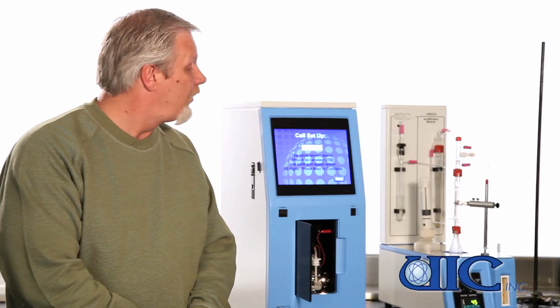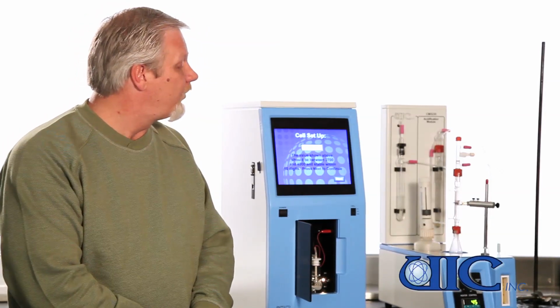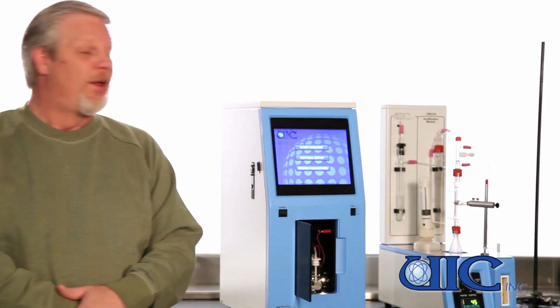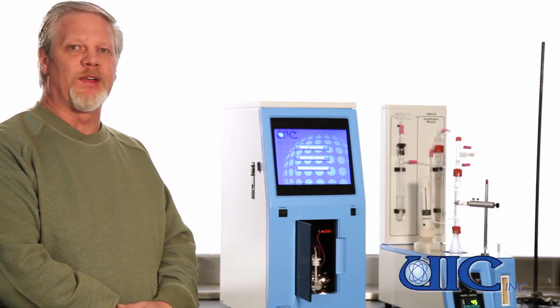So I look at it right now, I'm seeing a pretty constant value of 3557. So I'm going to accept that value by pressing the next button. What we've established here is the 100% transmittance through the cell.